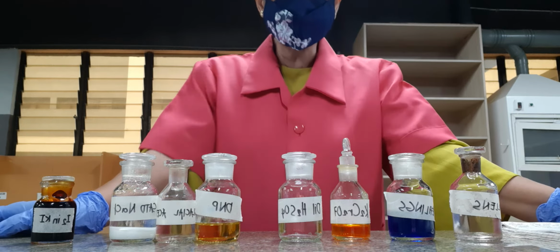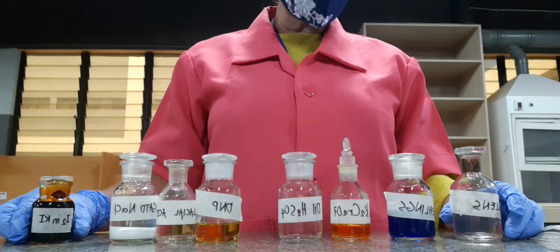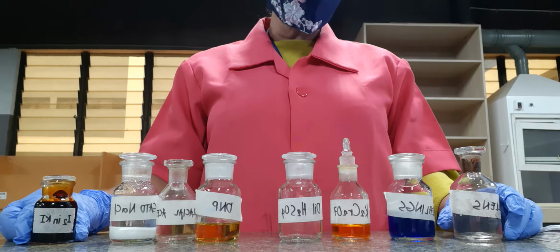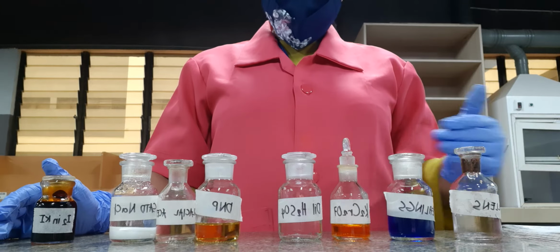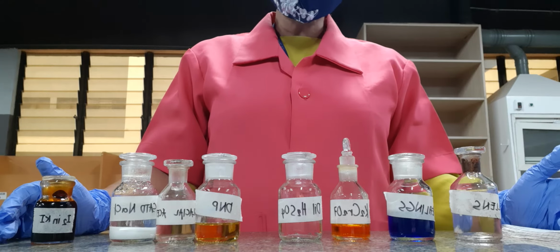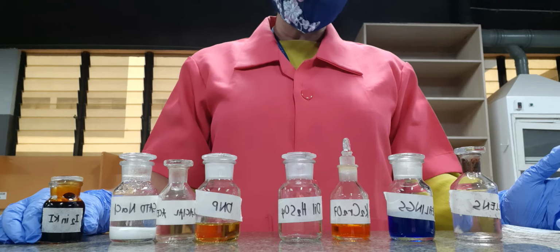So these are the different oxidation processes that we are going to undertake for the different aldehydes and ketones, as well as comparative tests for ethanol and tert-butyl alcohol, which is our tertiary alcohol, as well as water. Now take note, we have already tested some of this in experiment number 2 for organic compounds, which is alcohols and phenols.